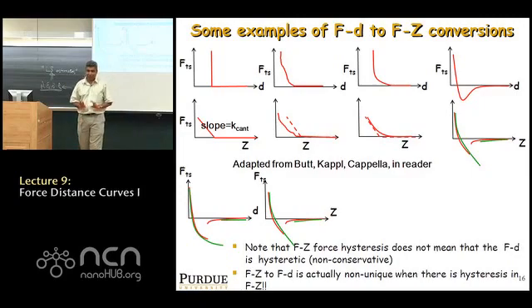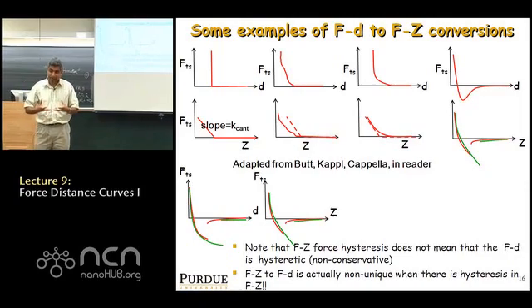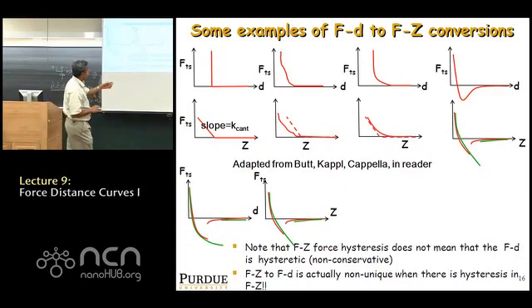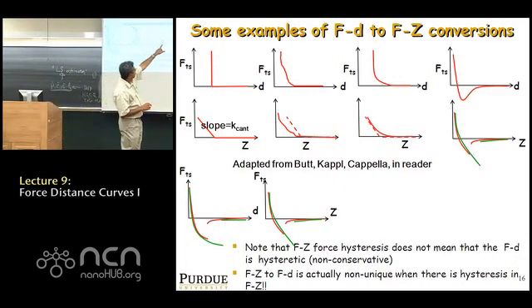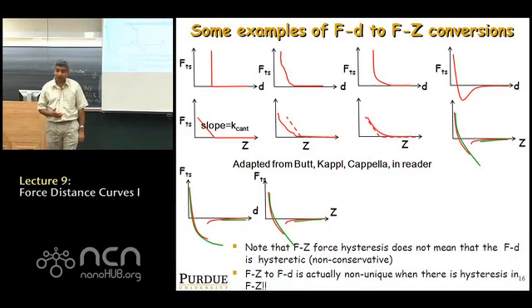So this is actually deep stuff. What this means is that when you have instabilities in snap-in and pull-outs, you are actually unable in any way to decide if indeed the interaction force takes the shape shown on the top right, or it takes the shape on the top left. So there is some non-uniqueness involved. How do you decide which one?